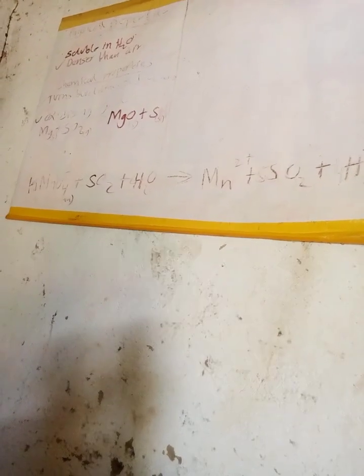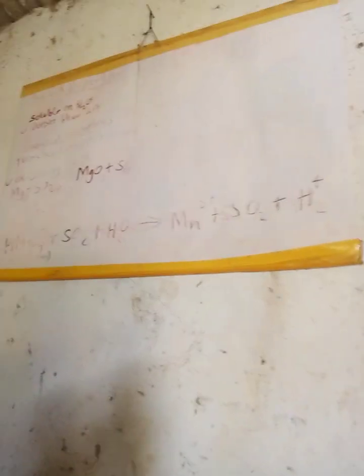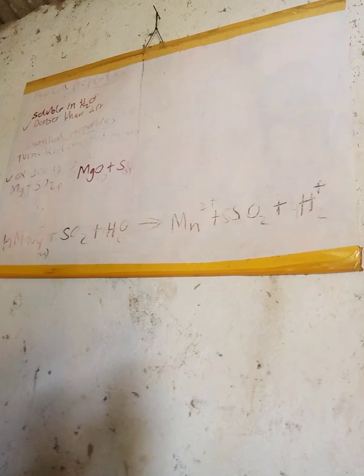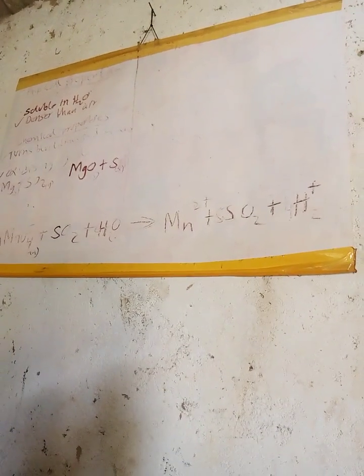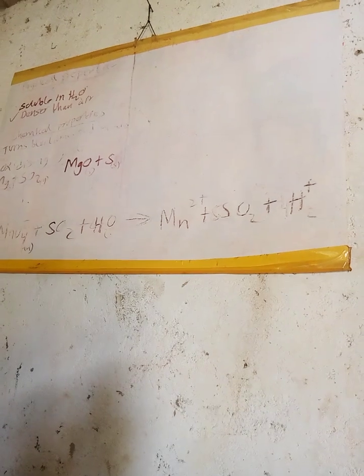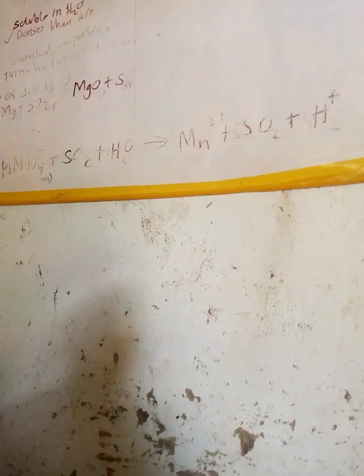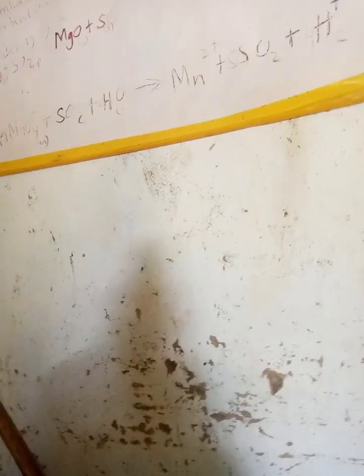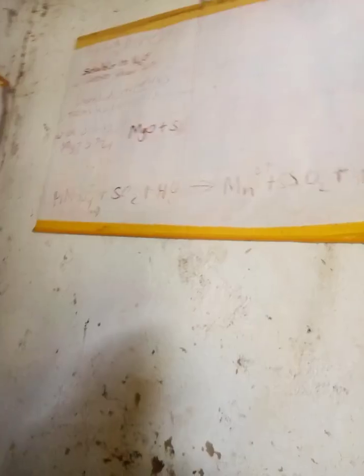The oxidizing property can also be shown when it is mixed with hydrogen sulfide gas. A yellow solid deposit of sulfur is formed, and that is also just the same as an oxidizing agent. When you mix this sulfur oxide with hydrogen sulfide, you form that one. So next, reducing agent. You see this sulfur oxide is an oxidizing agent, and it is also a reducing agent.